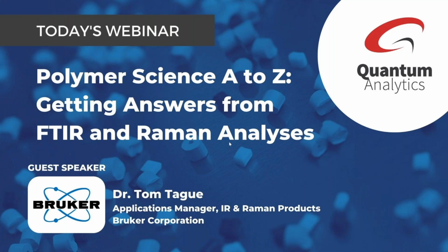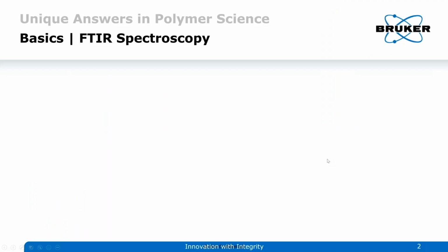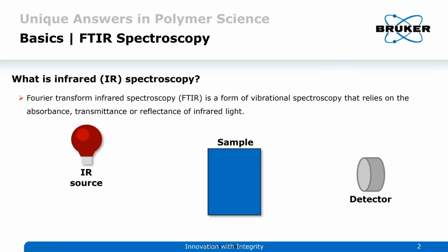Thank you, Lauren. I'm excited to meet with everyone today to talk about polymer science. We'll cover A to Z, which means essentially the full spectrum of examples. And I have a couple of examples which I think you'll be very excited about as well, especially a good reverse engineering example. So with that, I wanted to start from the beginning, just so that we understand what we're going to be able to do in doing an analysis.